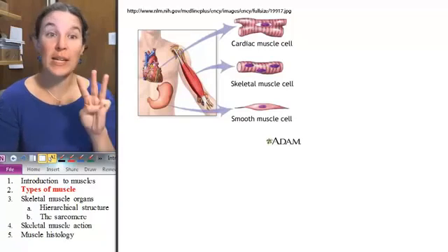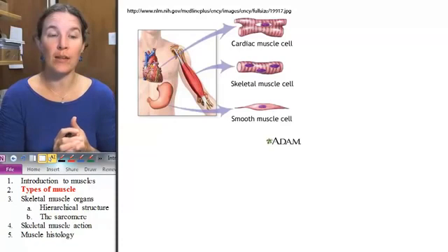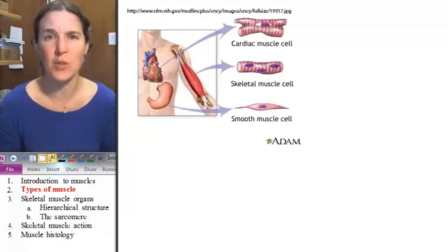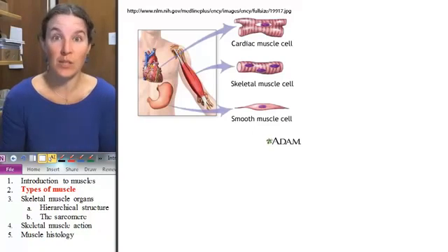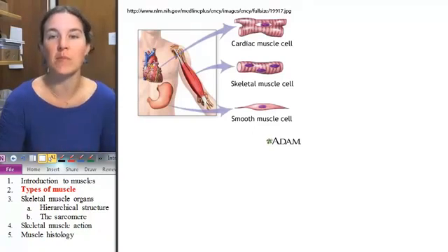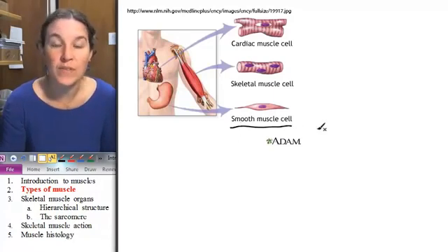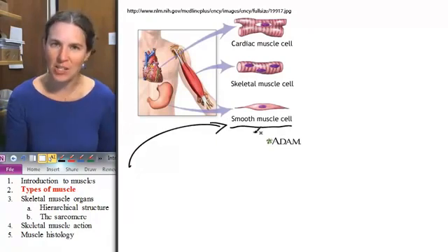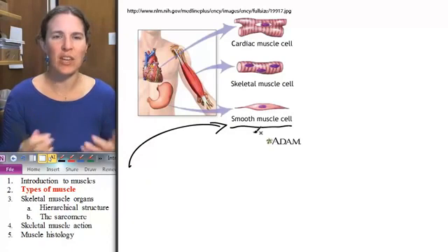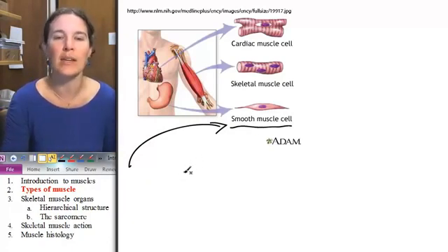All right, we have three types of muscle tissue that we're going to look at, and I think it's pretty straightforward. We'll have 3 slides in lab today, and in our slides, we'll be looking at these 3 different kinds of muscle tissue. One of them, oh, does this look familiar? We've seen it before. We've seen smooth muscle tissue actually a lot, and I would imagine at this stage that you are probably like, oh, show me smooth muscle. I'm cool. I can visualize where that is.